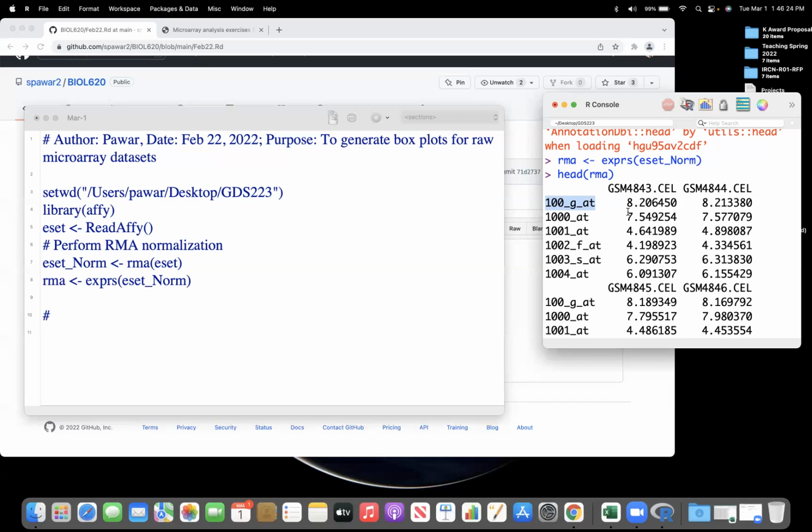For analysis, what we are doing is we are just taking a fold change. So do you know what a fold change is? What is a fold change? Fold? The scale. That is true. That is what we want to do. How do you do that? What is fold change?